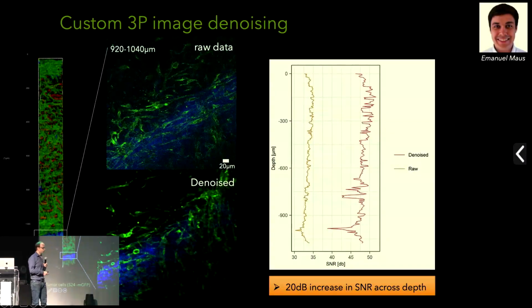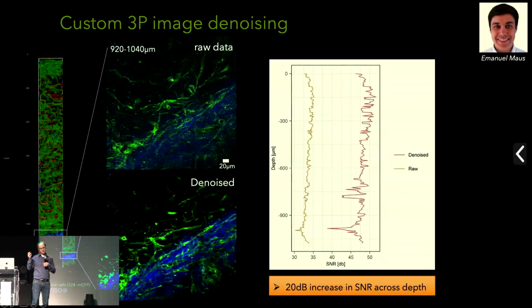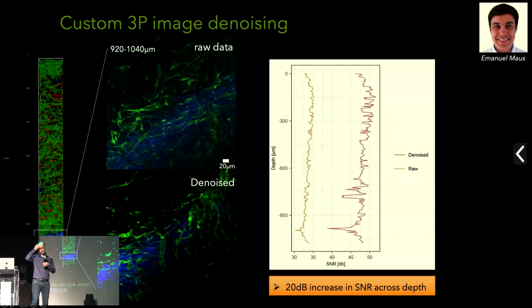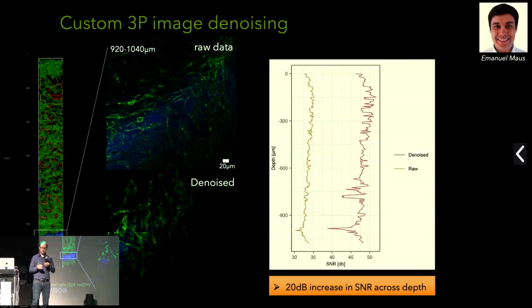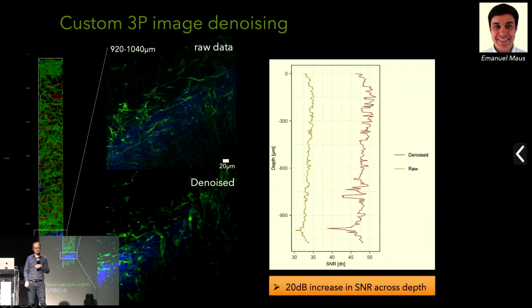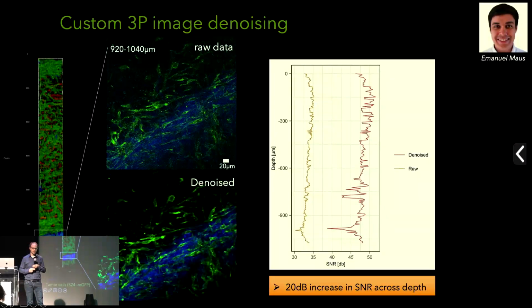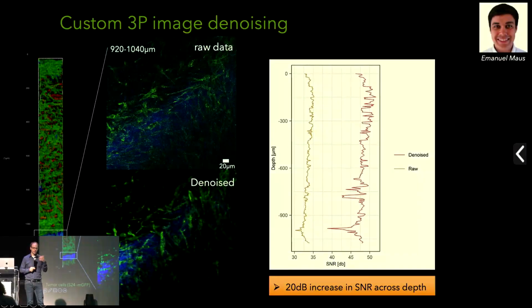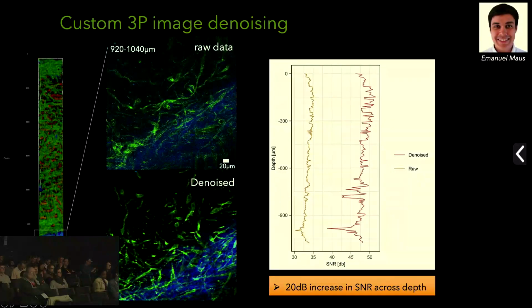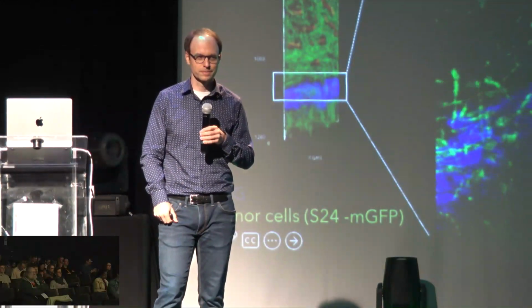And also when we compared the noise distribution and statistics to other papers that have used Noise2Void for two-photon microscopy, we just found that our distribution looks a lot different. So that's the short answer. So you really have to train your algorithm or your network on three-photon data. You can't just take one of the pre-trained two-photon networks and apply them.